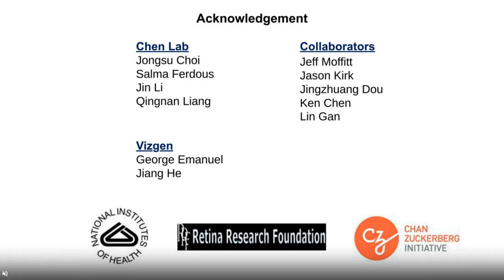Thanks for the question. As I said in the talk, our primary goal for this project is to identify all the cell types in the retina and also provide the spatial information. Since the number of cell types in the retina is quite large, and their proportions are quite uneven, we are really looking for something quite sensitive. By comparing a variety of technologies, we think in situ-based methods are way more sensitive than sequencing-based methods, which are limited by enzymatic efficiency. So that's the primary reason.